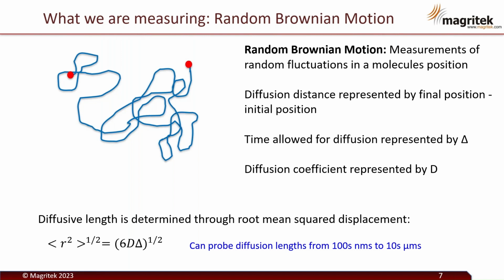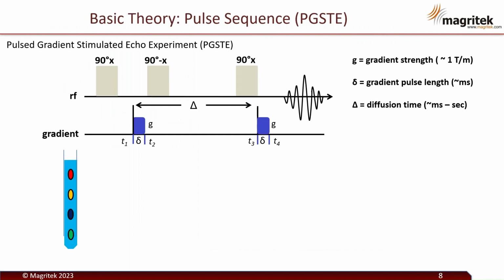So what is the basic theory behind these measurements? Let's simply look at one of the most basic diffusion edited pulse sequences, which is the pulse gradient stimulated echo experiment, or PGSTE for short.